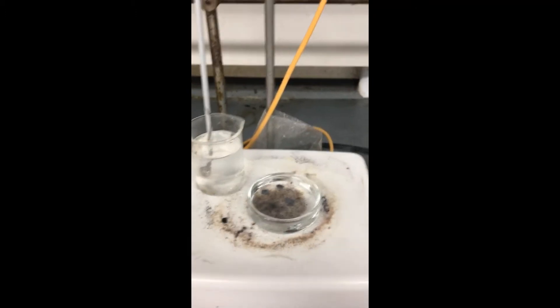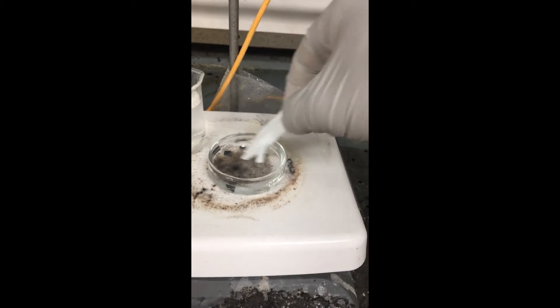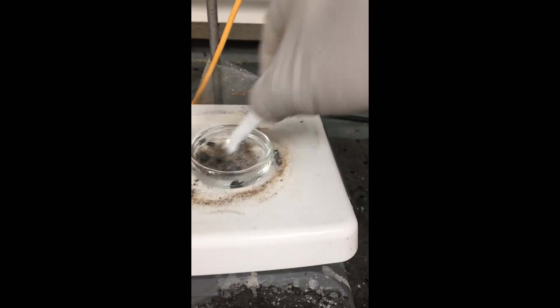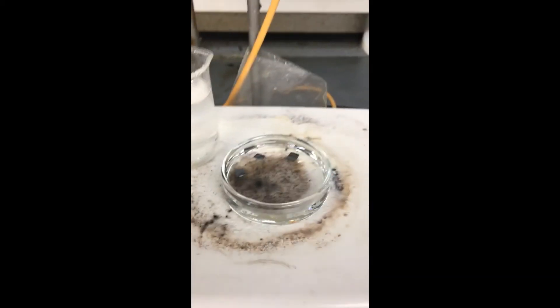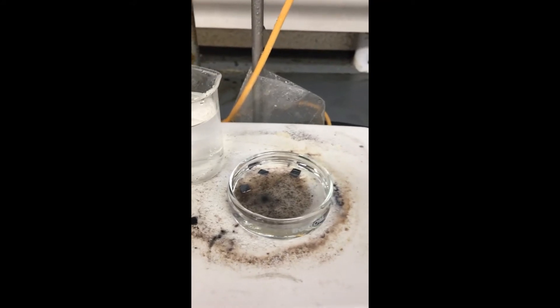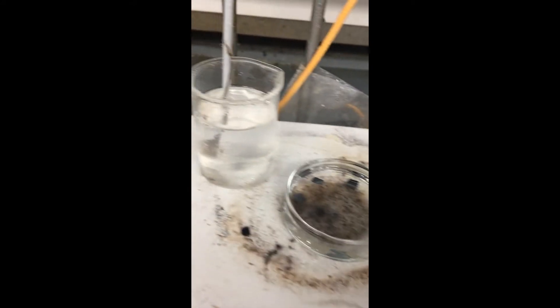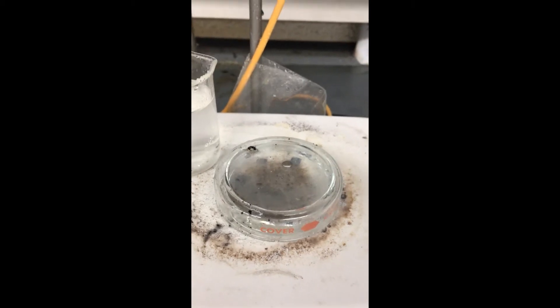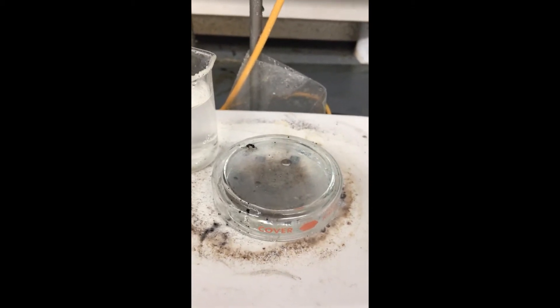Now I'm going to take my Teflon tweezers and carefully mix the solution a little bit to get it thoroughly mixed. Then I'm going to take a cover and cover it. We'll let that sit for about an hour.